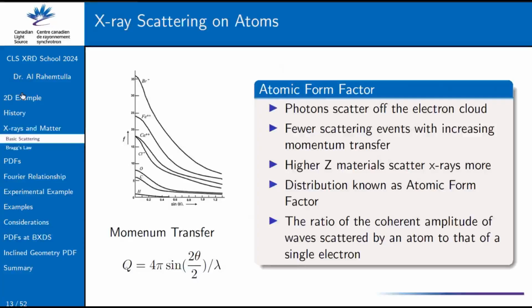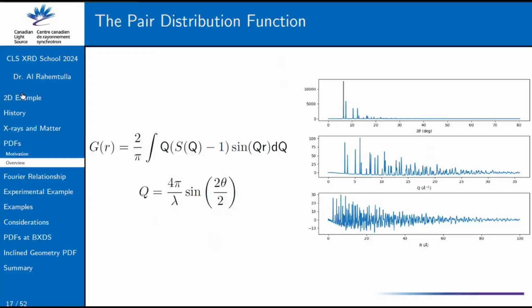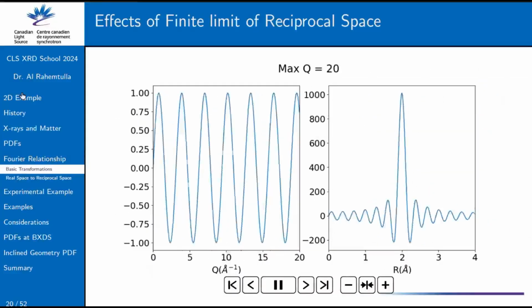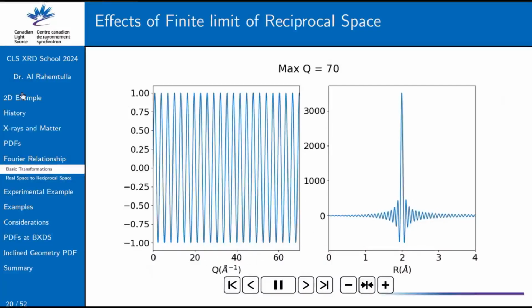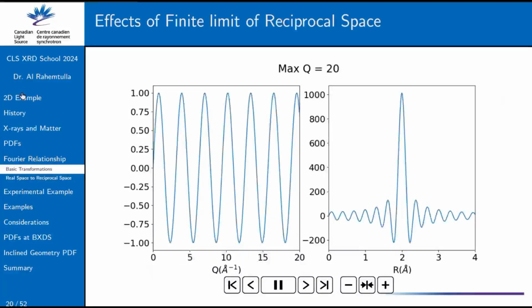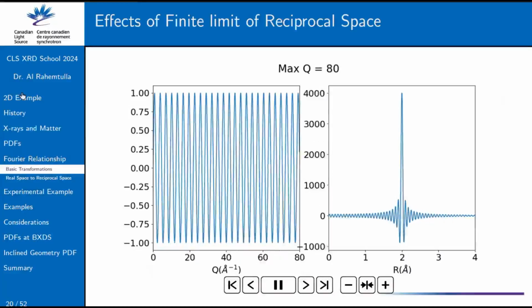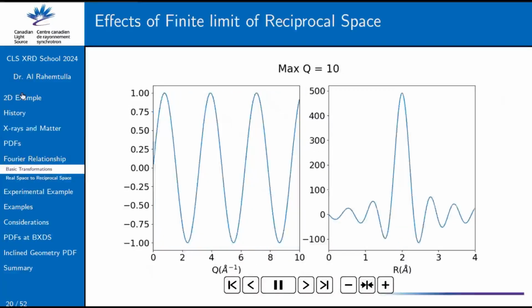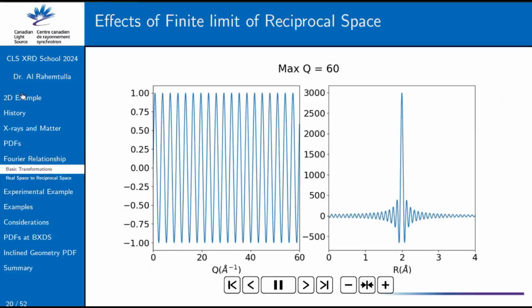Yes, Scott, I have a dumb question too. Since those ripples are a function of your limited ability to scan to super high Q, why wouldn't you just mathematically subtract that out of the data, because you know the Q you scan to? So it's due to the finite nature. The only way to really get around it is to know what your signal is beyond that window, right? The window is determined by the fact that you haven't measured out beyond that threshold.